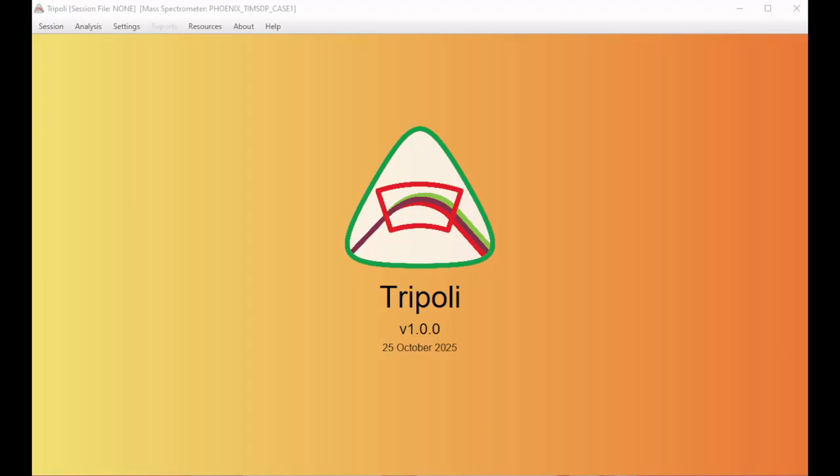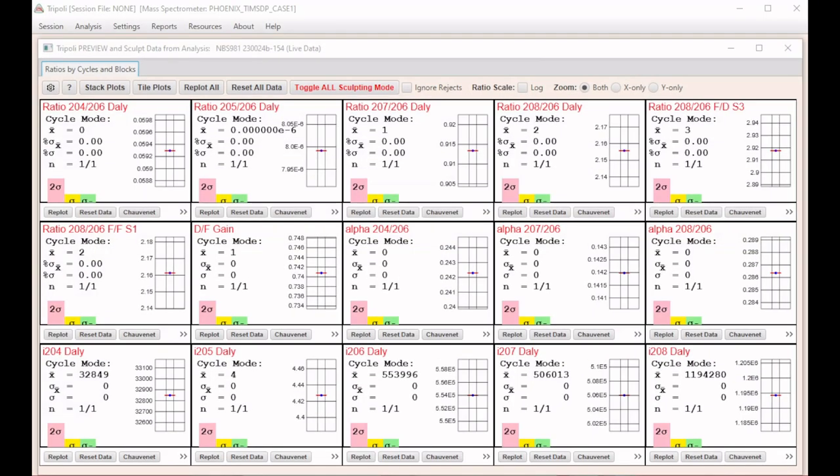For this demonstration, I'm just manually inserting the text output files that would be given by the mass spectrometer and dropping them into the live data folder for the analysis in order to simulate the mass spectrometer creating these files in real time. The speed of this reading might differ. As I drop in the first output file, we can see the plots window will automatically render with the available data, which is just 1 point currently.